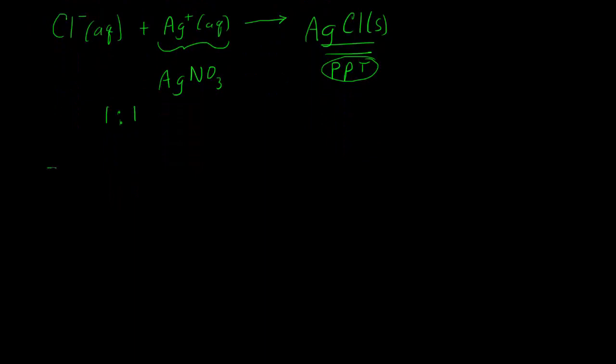I've got a little piece of metal that I've put on one side and immersed in a solution. I've got another piece of metal that I put on the other side of the solution. Inside this region right here, it's filled with liquid, so I'm going to draw some little waves up here. Inside this liquid, we've got a couple of different kinds of ions. So we've got sodium cations, let's say, and chloride anions.